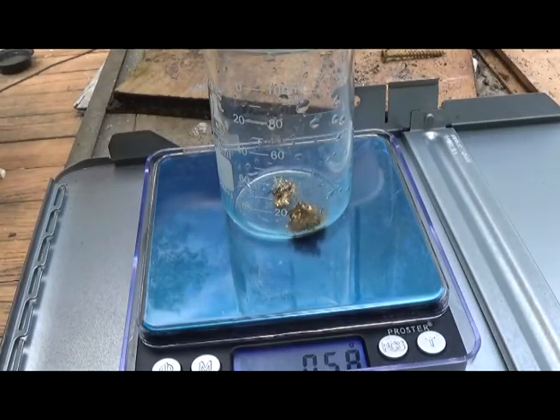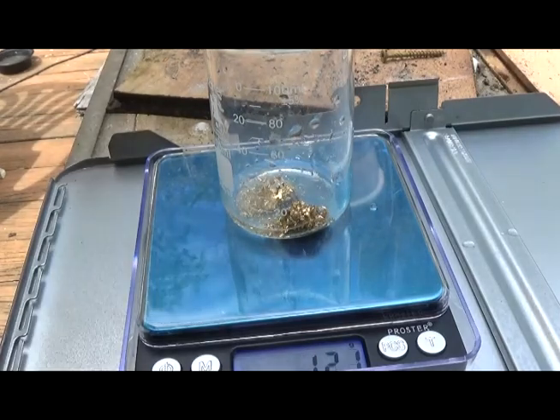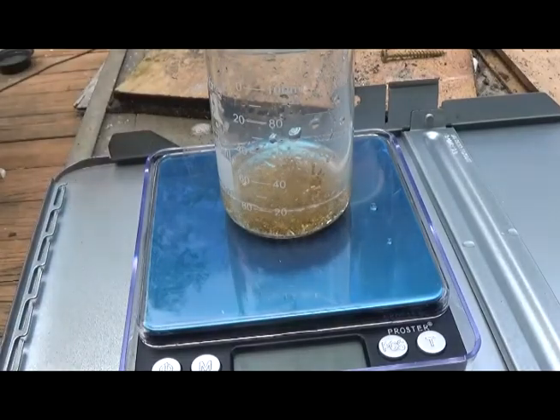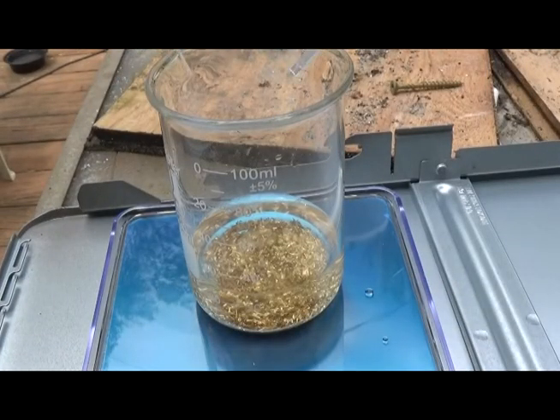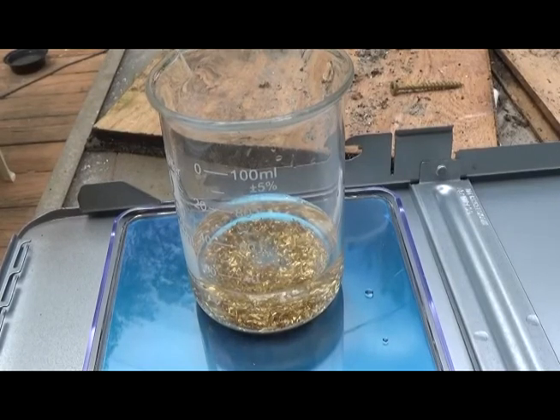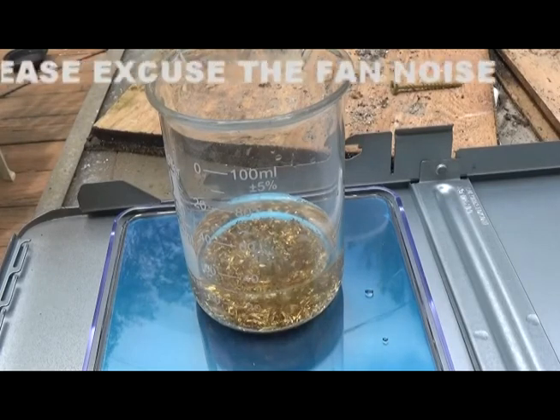We'll go with half a gram — actually a full gram, half a gram, that will work. We know what we've got now so we don't worry about the weight anymore. We'll turn off the scale and pour a little hydrochloric acid in it. Then 1 ml of nitric acid — nitric that's a couple years old — looks like we have a reaction. Beautiful. Let's just sit here and watch it work.